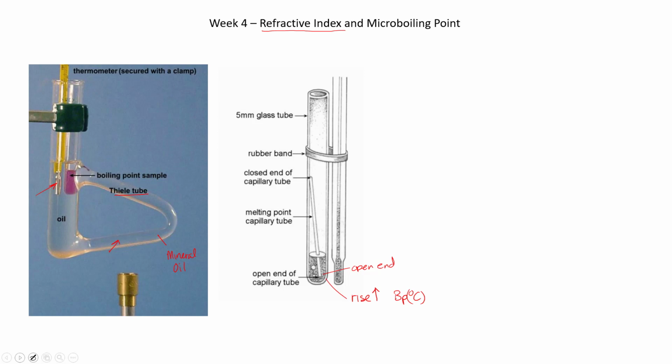And again, this is a very useful technique to measure the boiling point when you only have a very small amount of liquid.